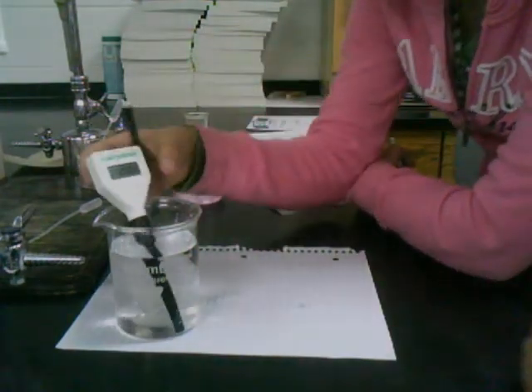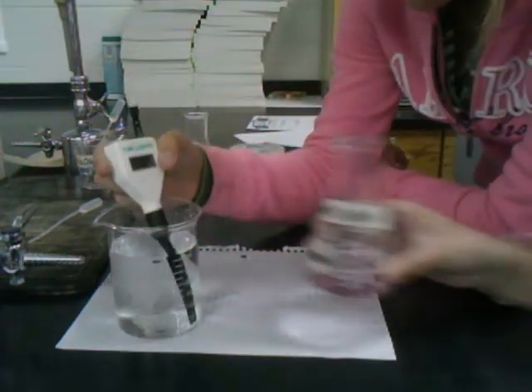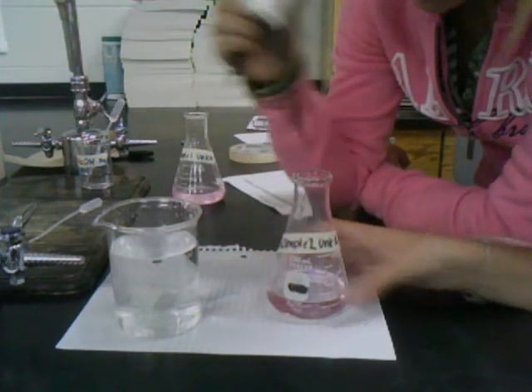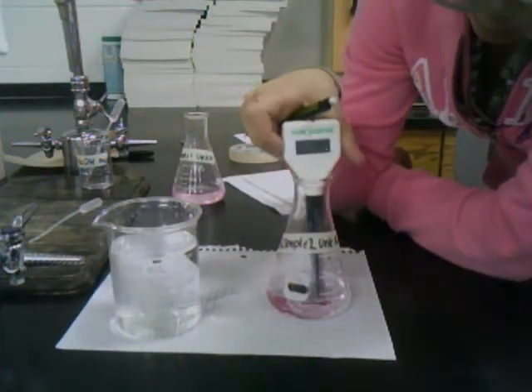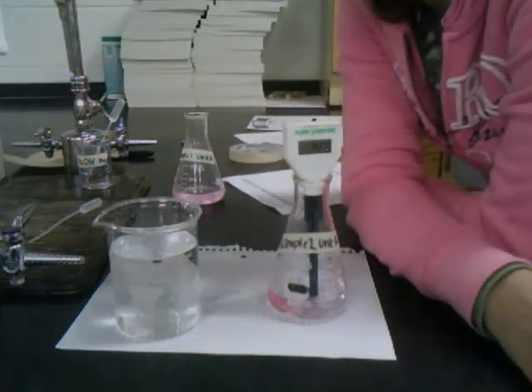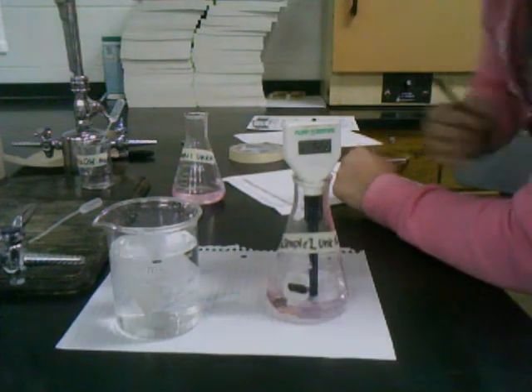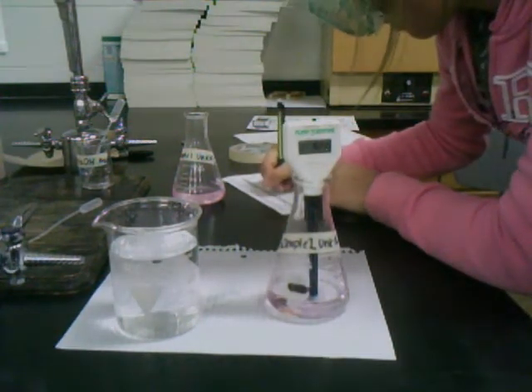We have unknown A sample 2, and I'm now reading the pH. It settled on 9.21. Now I'm going to rinse it back off in the water.